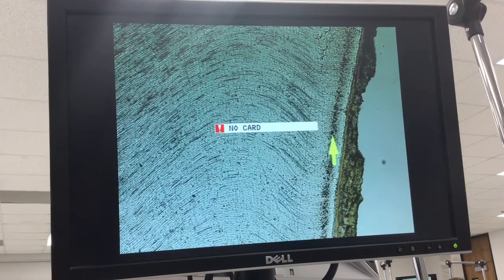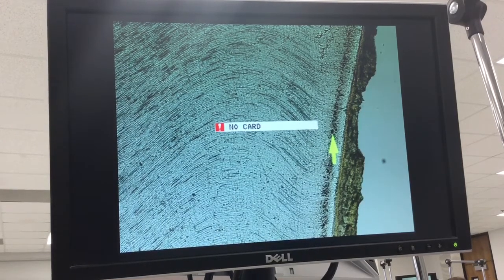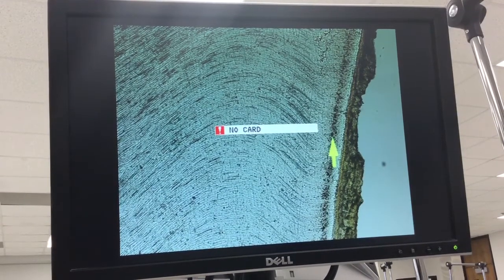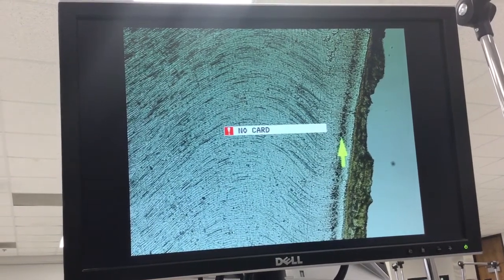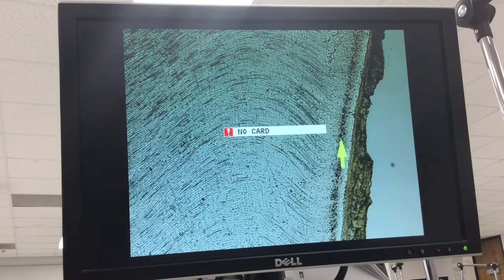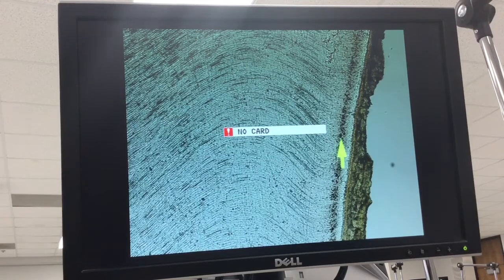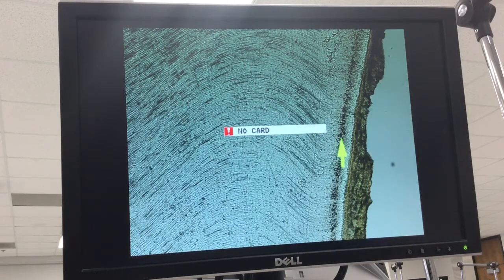Now, if you can't get this to work for you, and I can give you some help with this, I also have another stereo viewer with a couple of pictures printed out from a PDF file of the same thing, with a stereo viewer that's a little bit easier to use. So if you're rather klutzy and you can't get this to work for you, I have the other stereo viewers. This is not like the magic eye that you used to look at in the newspaper. Okay, these are two stereo pairs. And so it is possible to take them side by side and cross your eyes and get them to blend. Some of you may have done that.